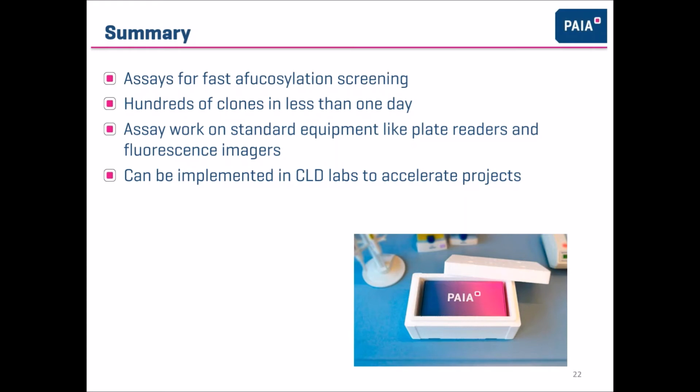These assays work on standard equipment in the lab: plate readers, shakers, imagers, etc. So they can really be nicely implemented in CLD labs and hopefully accelerate the clone selection and finally the projects. So thank you very much for your attention, and I'm happy to answer any questions.